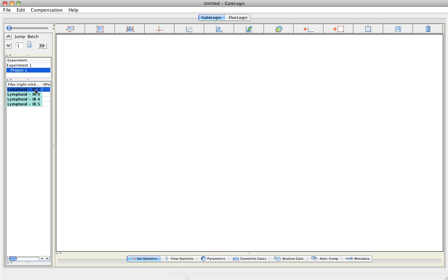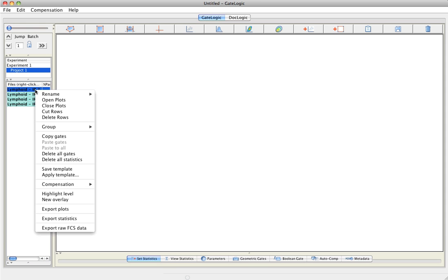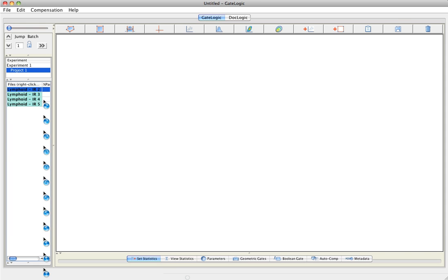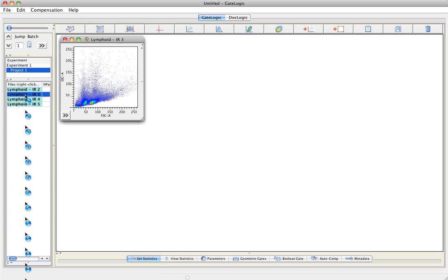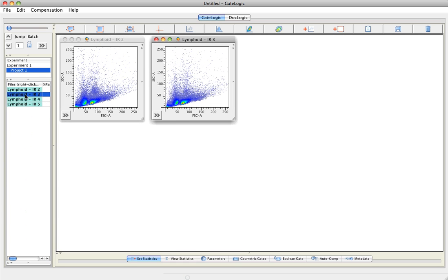If you go down to the files that you have imported and right-click, you can open plots. You can also double-click to open the plots.